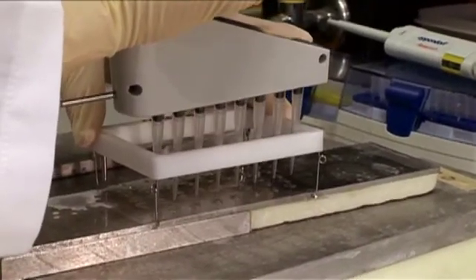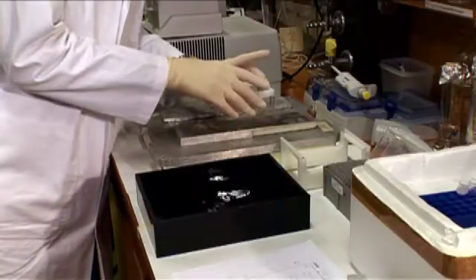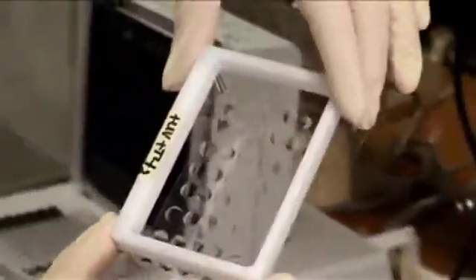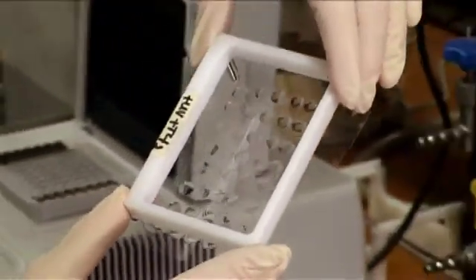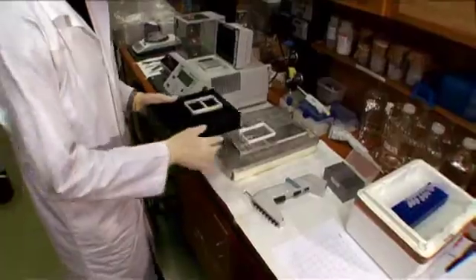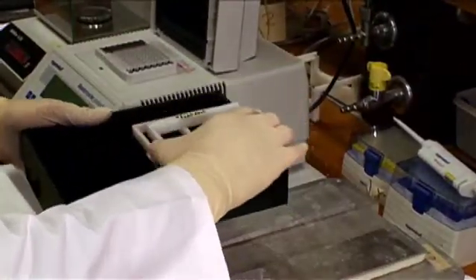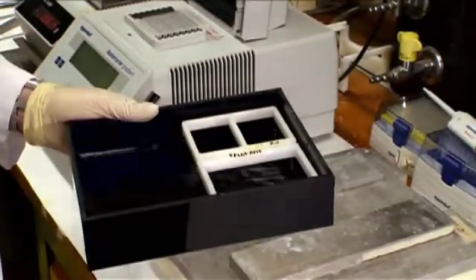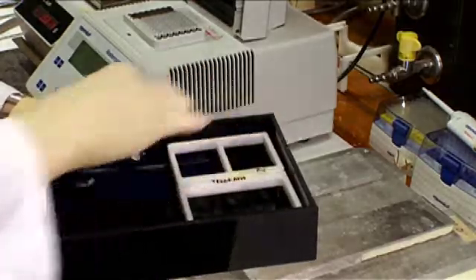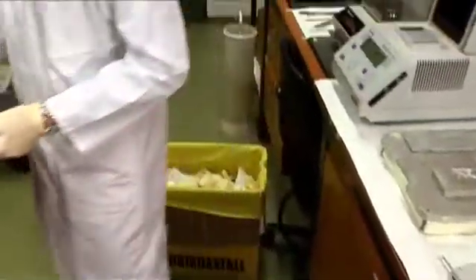So now we made 6 times 8 gel dots. The agarose has solidified. Now we have cells molded into these agarose droplets. I transfer that over to lysis buffer, which will incubate now for an hour. Like this. In this tray we can have 4 frames.